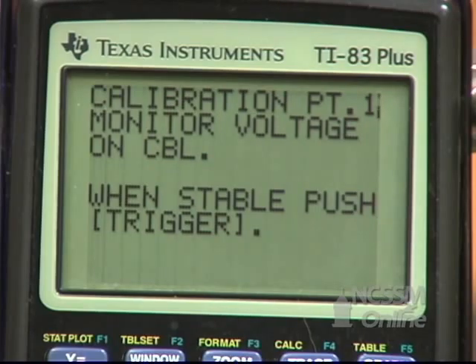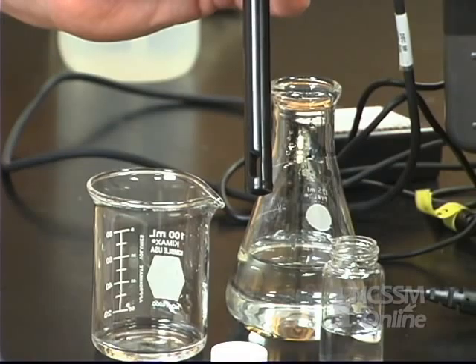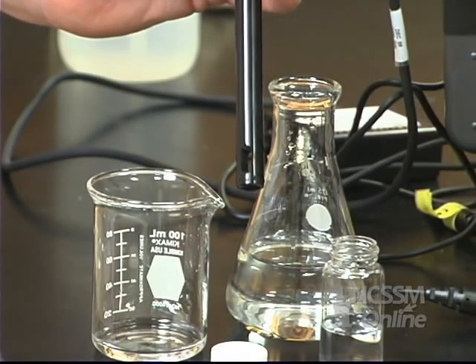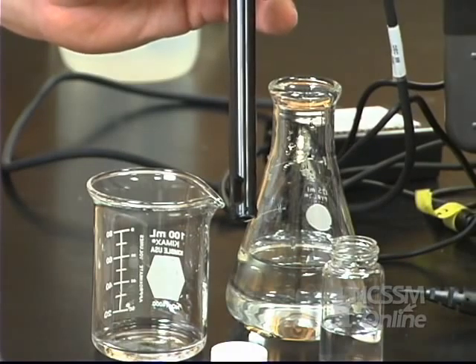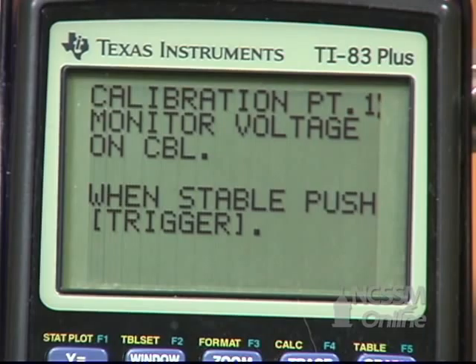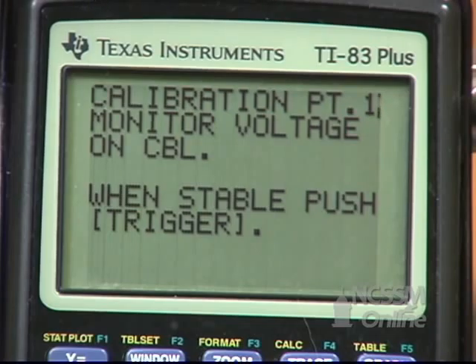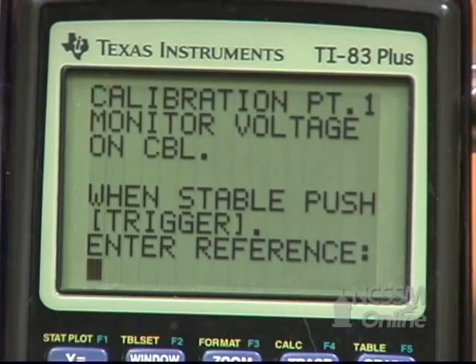This is a two-point calibration. For the first point, remove the conductivity probe from the distilled water — the first point will be taken in air. Wait for the reading on the CBL to be stable, then press Trigger on the CBL and enter a reference value of 0.